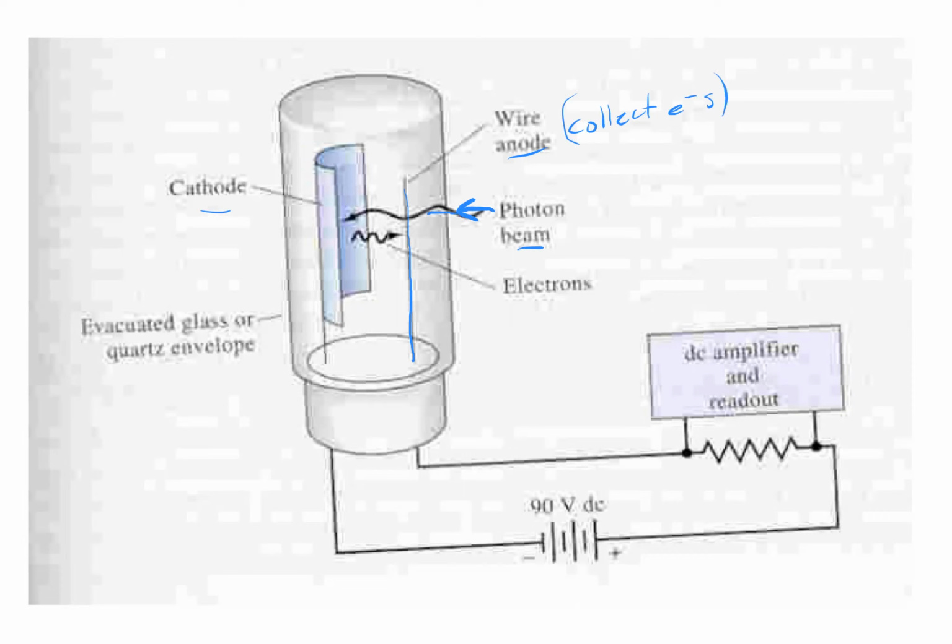But the photon comes in and it strikes the photocathode. At the photocathode, that's where the electrons will be produced through one of these ionization events, photoionization. The electron which is produced is going to be accelerated towards the wire anode, where it will be collected and pass through a wire to the outside world.